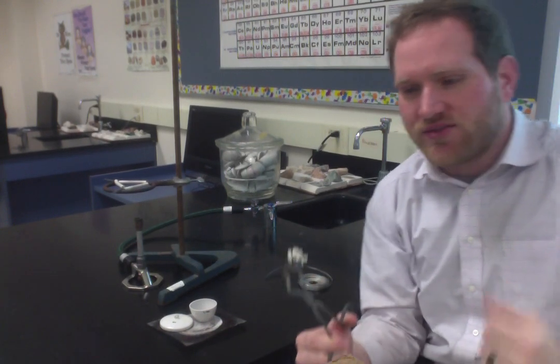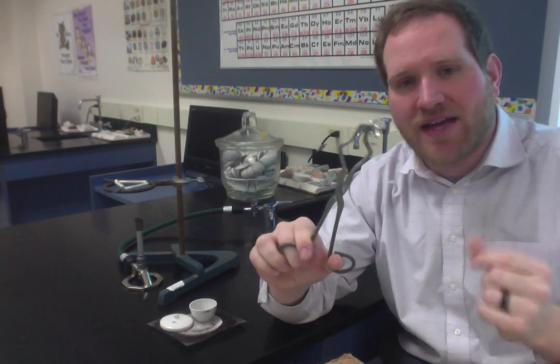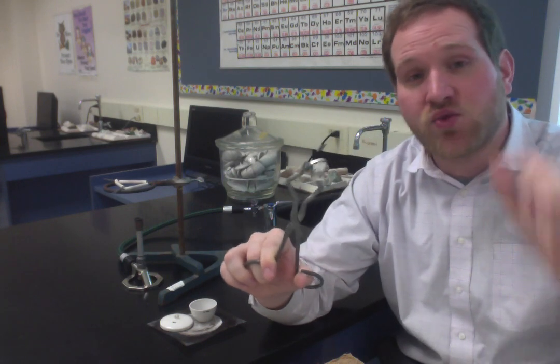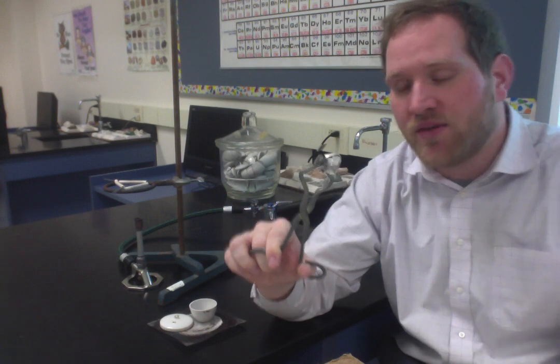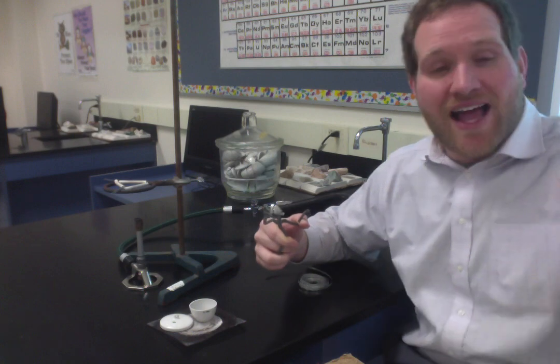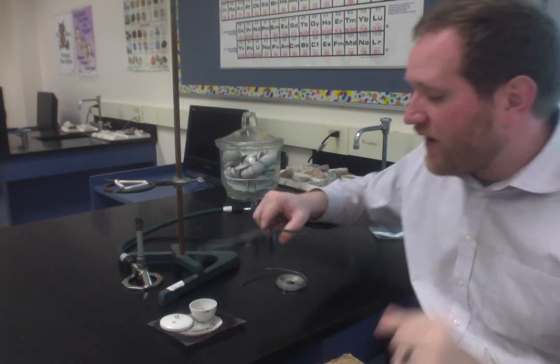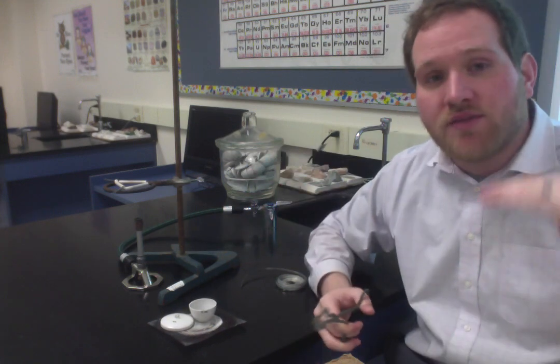And we're going to do this concept called heating to constant mass. Think about it. Imagine it was 80% done, but not 100%. And by done, I mean turned to magnesium oxide. If 80% of the magnesium turned to magnesium oxide and 20% of it was still magnesium, that means that when you burn it again, the mass should actually go up. So if you burn it again and the mass goes up, that tells you that you weren't done the first time. And in fact, you're going to even run a third burn to make sure.